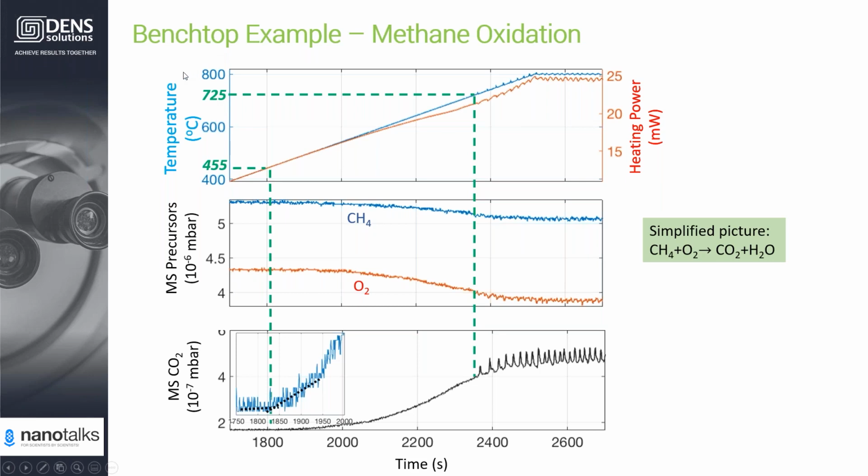This is a result just run from a profile. I just click start on the profile, leave the computer to control everything, and get those results. And if we look at this, especially the oscillation, you have up and down, up and down. So maybe you will come to a question: what's the phase relationship between the reaction and the calorimetry data?